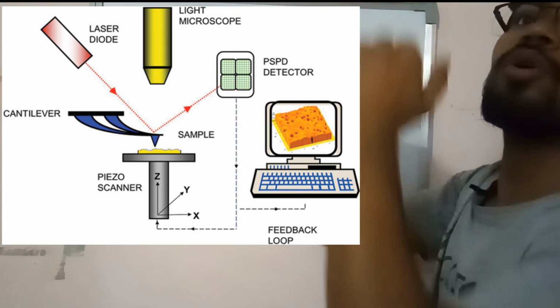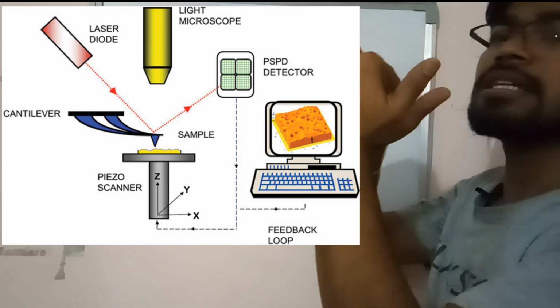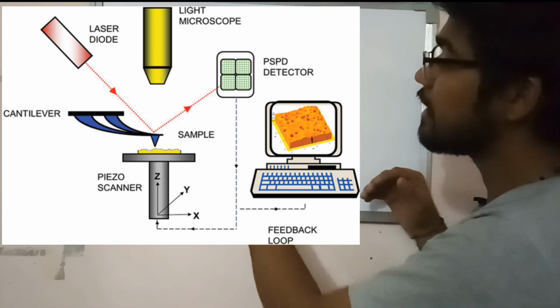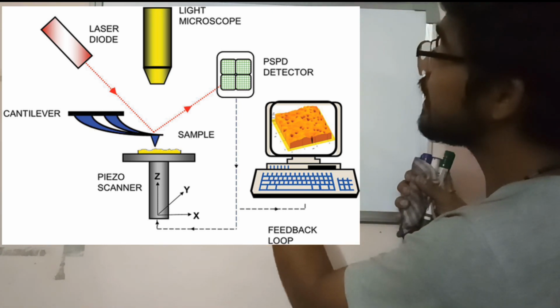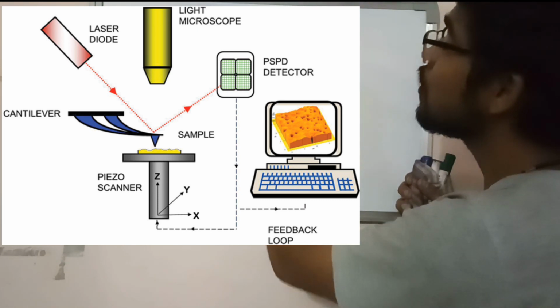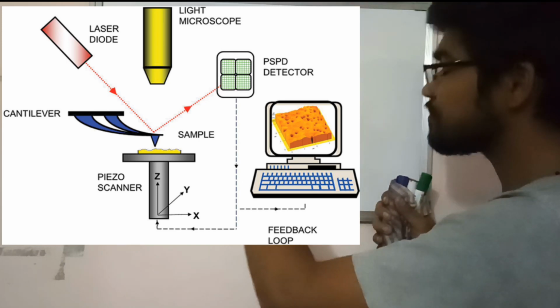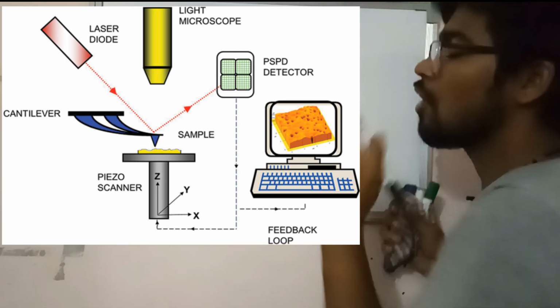So the radiation will go late. So they find there is a hole or a downward area there. Like that, here the cantilever goes very down, so the rays will go very slowly or very late. So they find there is some depth in the object.